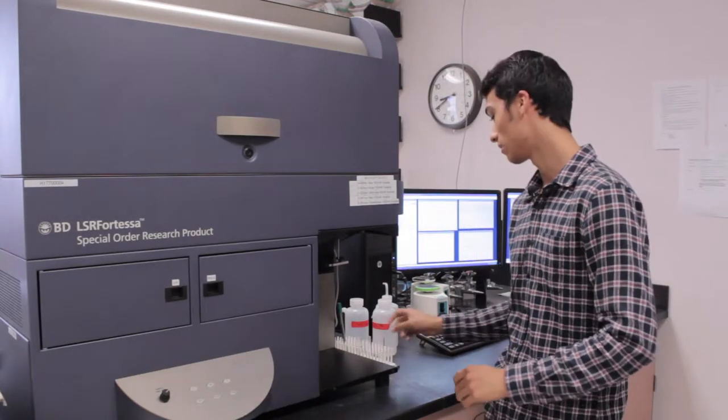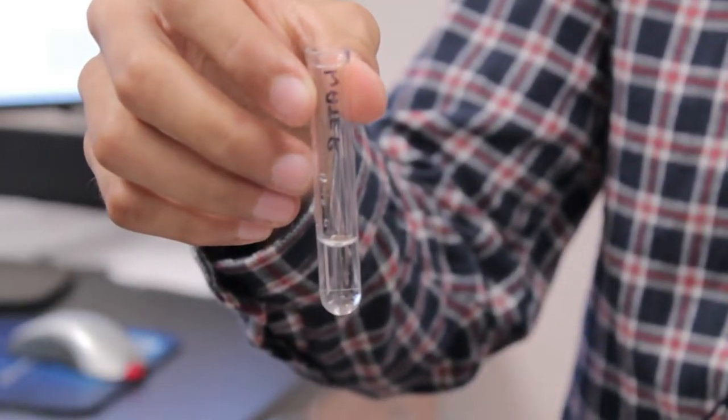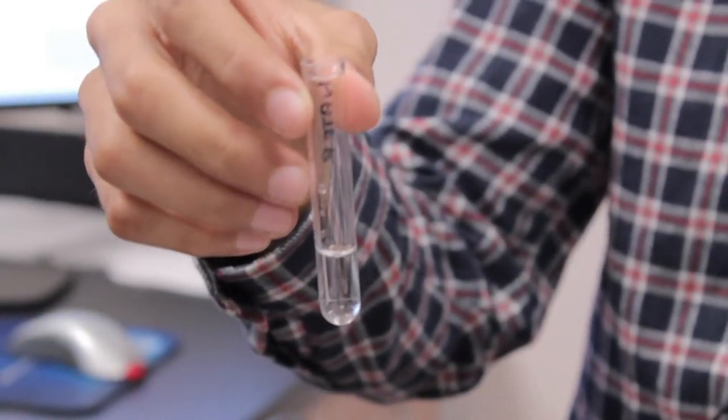In order to use this machine, you must first place the population of cells that you want to analyze in what is called suspension buffers. Once they are suspended, you may proceed to the next step and place the tube in this compartment.